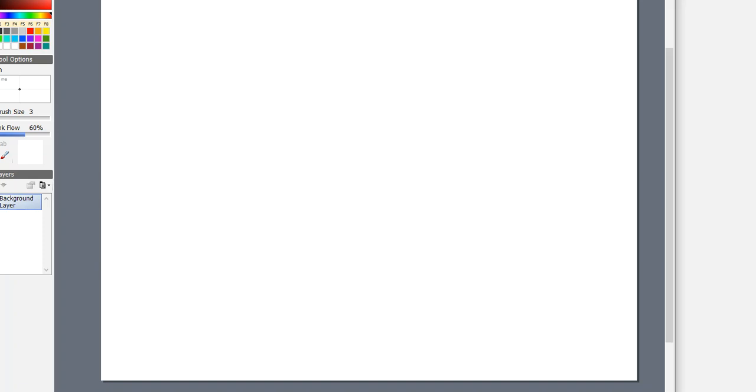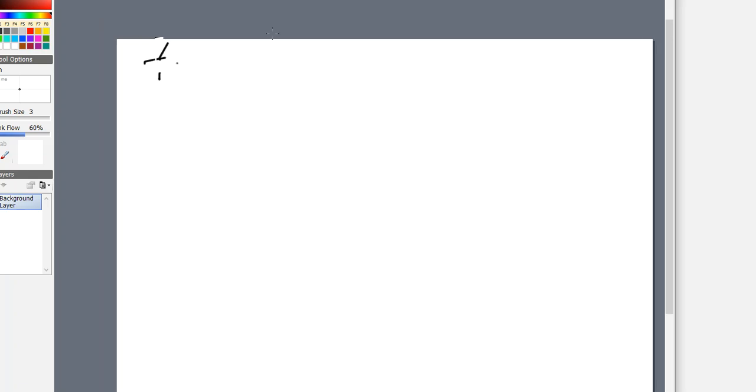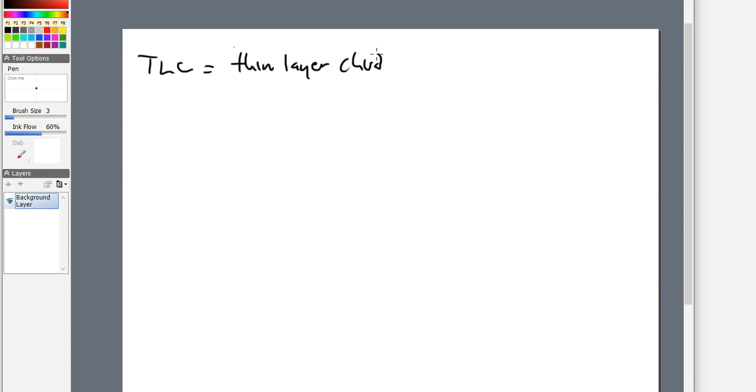All right, so first off, I guess that we can say that TLC is going to be this idea that, oh no, my smooth draw is not working properly. So TLC stands for thin layer chromatography. That's what this is all about, and this is really what we're going to have to start talking about as far as the way the development goes.